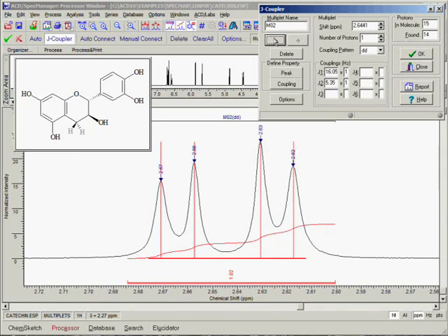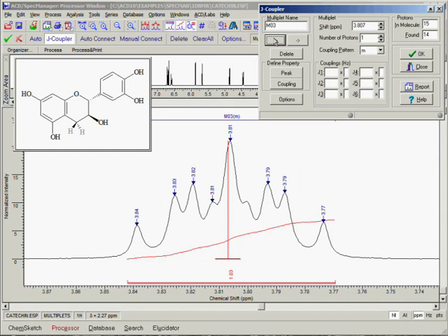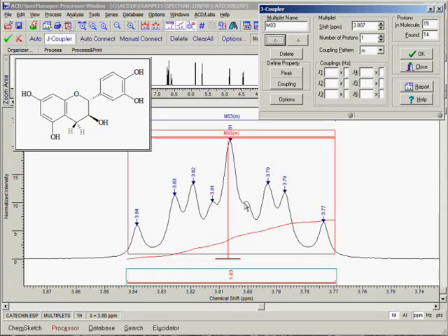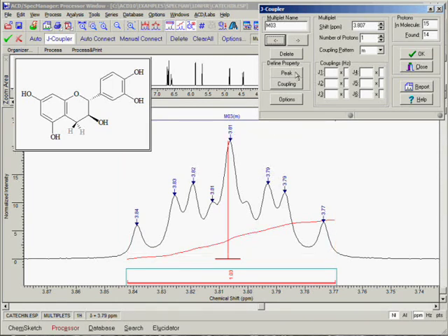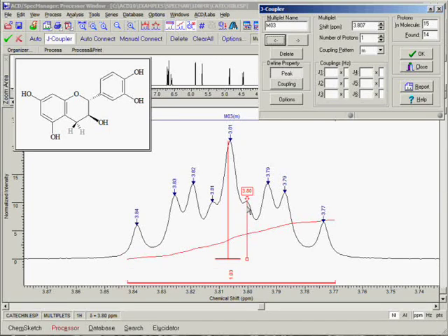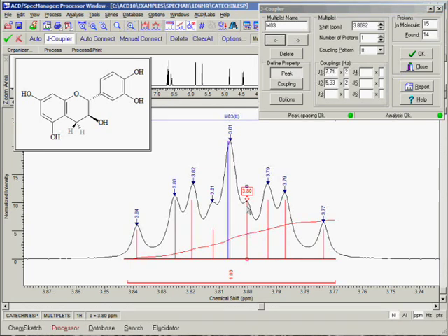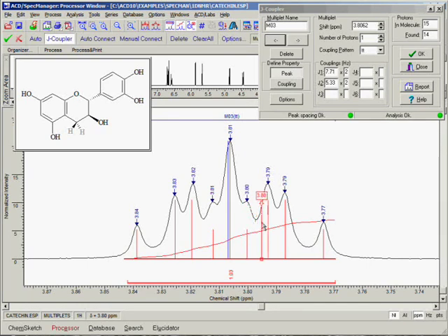For multiplet number 3, we can see that the automatically determined coupling pattern is not correct because a peak that is part of this multiplet has not been picked. Fortunately, we can correct this problem quite easily. Simply click the peak button in the J-Coupler dialog box and then move the cursor underneath the peak you want to pick. If the red peak line appears, click the left mouse button and the peak will be picked. In some cases, the peak is a subtle shoulder on another peak. If this happens, simply hold down the Shift key while the cursor is under the spectrum curve and this will force the red peak line to appear, then click the left mouse button. As you can see, as soon as the missing peak is added to the multiplet, the proper coupling pattern is detected and no further action is needed.